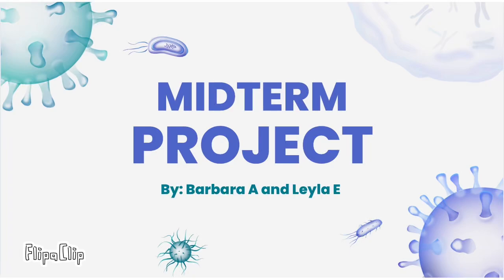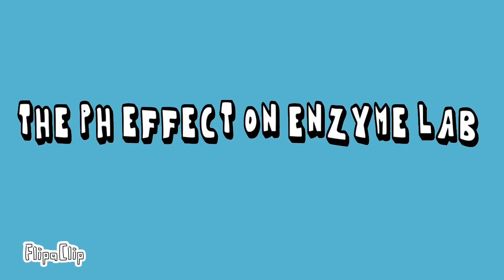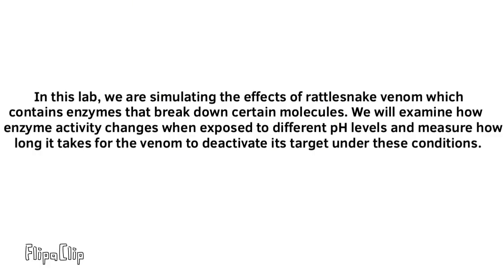The midterm project by Barbara and Layla. The pH effect on enzyme lab. In this lab, we are simulating the effects of rattlesnake venom, which contains enzymes that break down certain molecules. We will examine how enzyme activity changes when exposed to different pH levels, and measure how long it takes for the venom to deactivate its target under these conditions.